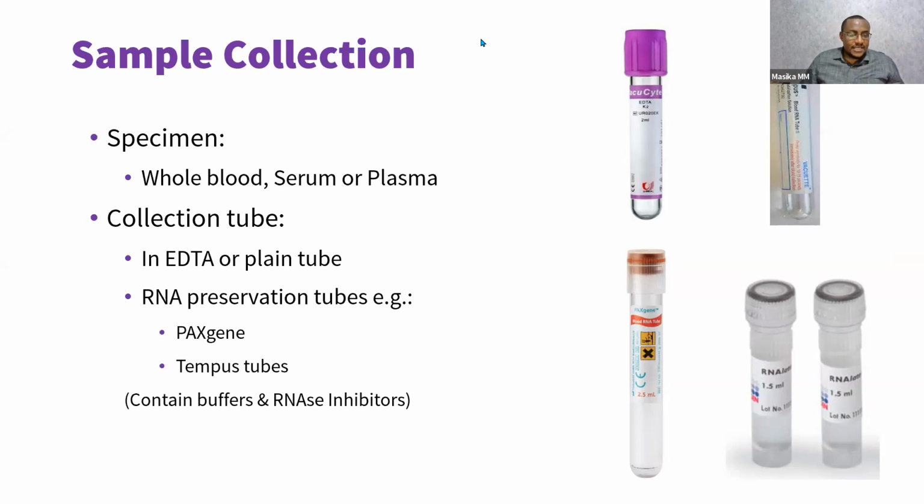I'm reading your questions again. I don't think you can recycle the primers if they already have been added to the suspect. You recycle them in each cycle, not after; you can't take them to the next test. But for each cycle, for each PCR, you keep using the primers that are in there.